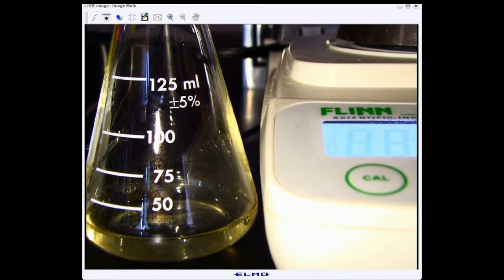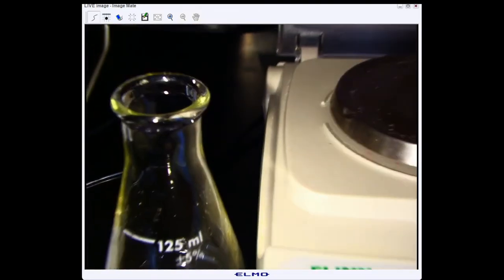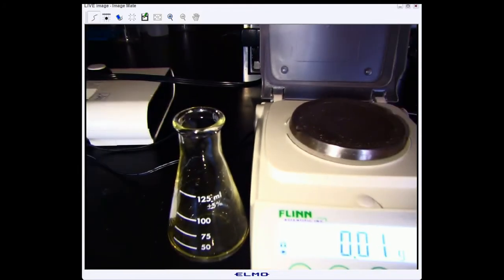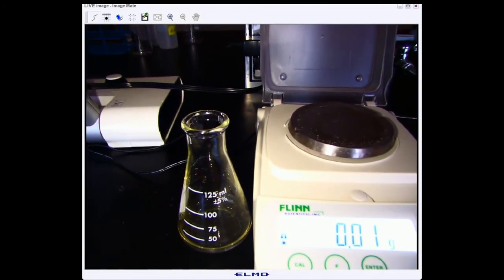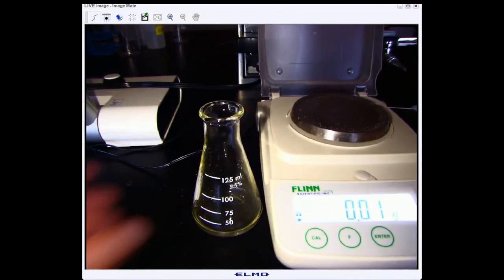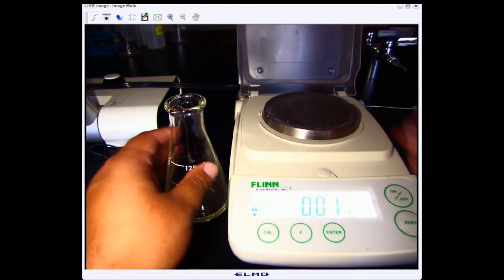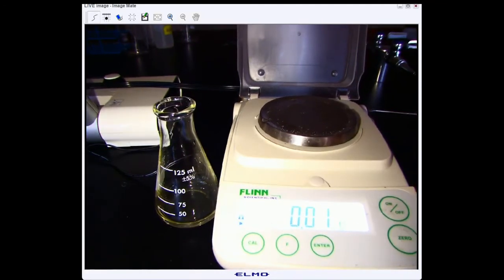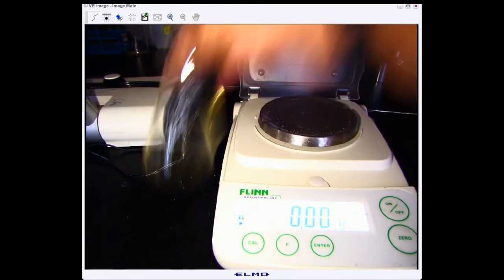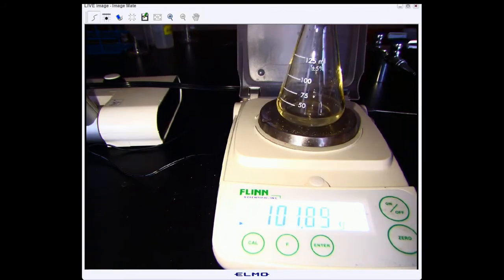Our next step is to record the mass of the vinegar and the flask. You'll notice that our scale is not displaying zeros right now. So I'm going to press the zero button and now we can record that. Take a moment to record that data.